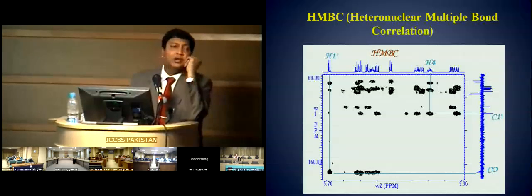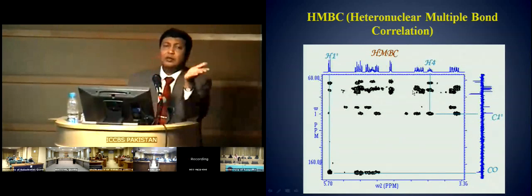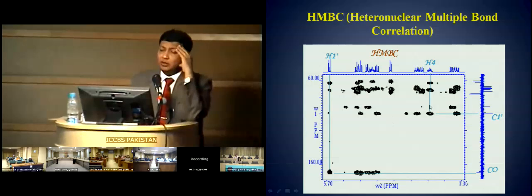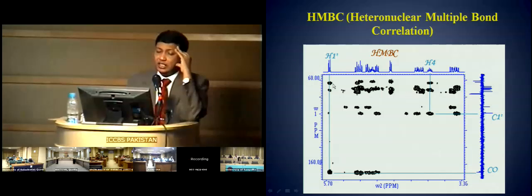That's how you determine it, with exactly identical philosophy. In inverse NMR spectroscopy, you're detecting the long-range coupled carbon indirectly through their effect on proton. Number 2, you have spread the long-range coupled proton in the scale of carbon.